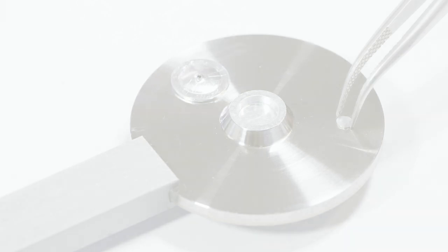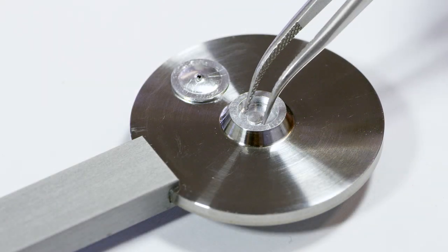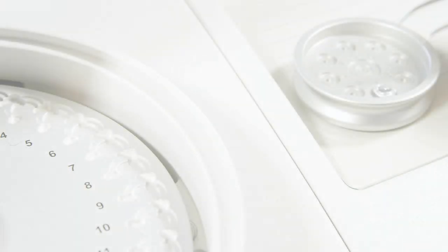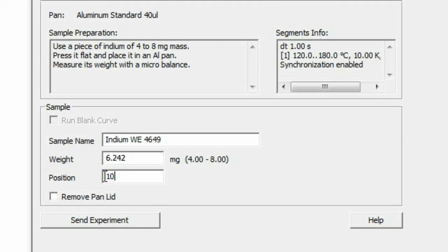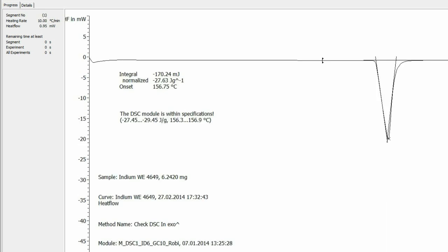You have seen how to prepare a reference substance, how to insert the sample into the DSC, how to program and start a DSC calibration, and how to evaluate the resulting curve.